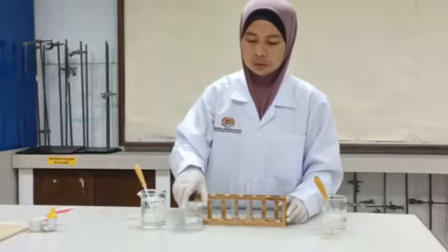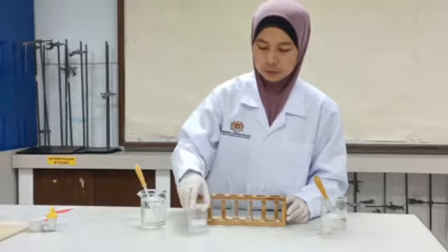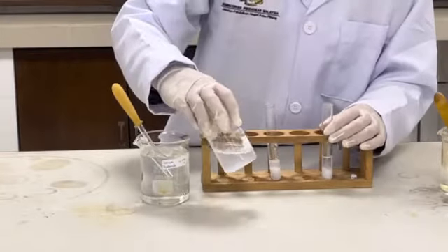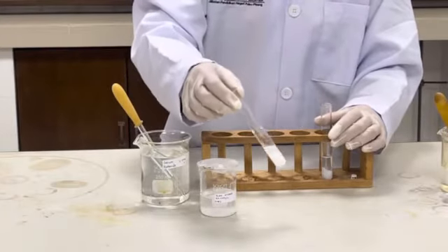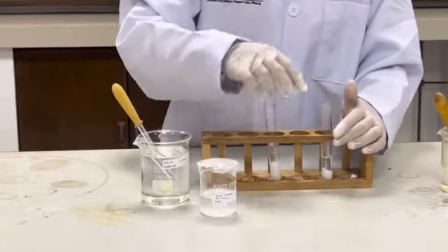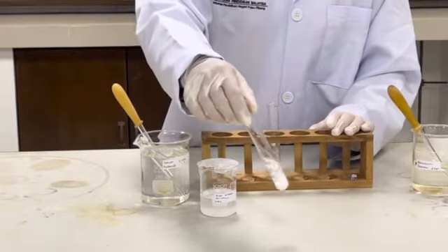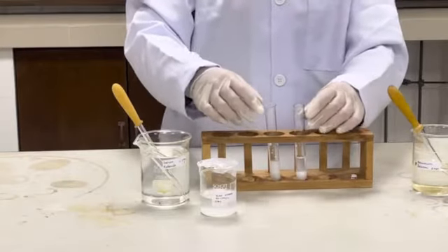Now test the cation for zinc nitrate solution, the zinc Zn²⁺ ion. Here we add 2 cm³ of zinc nitrate solution. For the zinc Zn²⁺ cation, tested with sodium hydroxide in excess, the white precipitate will dissolve and turn colorless. With the ammonia solution in excess, the precipitate also dissolves and turns colorless. You see, it becomes colorless.